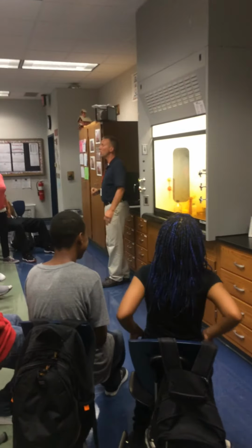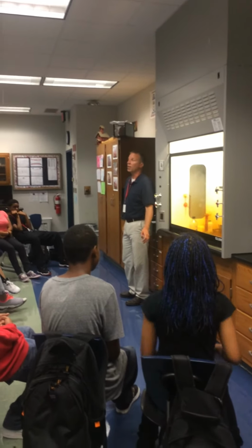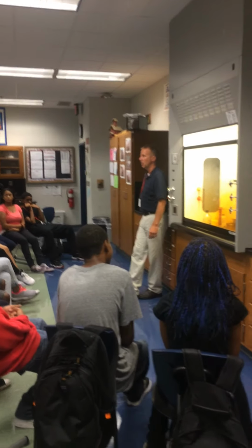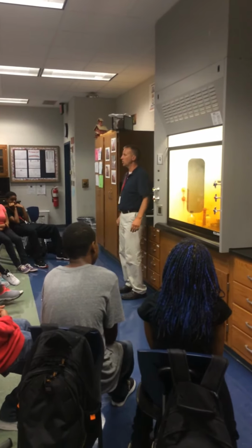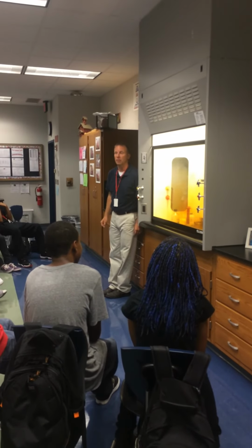Guys, that graduated cylinder, you know how I was holding it up and showing you guys? I don't want to touch it right now. It's about 200, 250 degrees. It will burn you. The inside there is a test tube holder. When I pick it up in just a few minutes, I will use the test tube holder to get it out and move it.